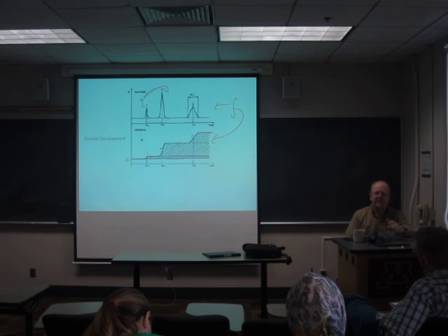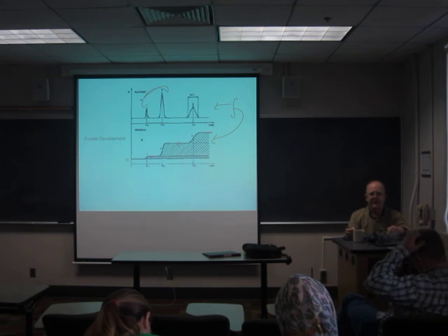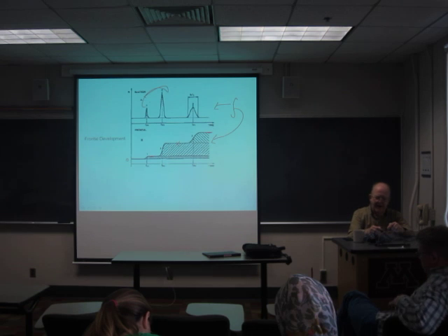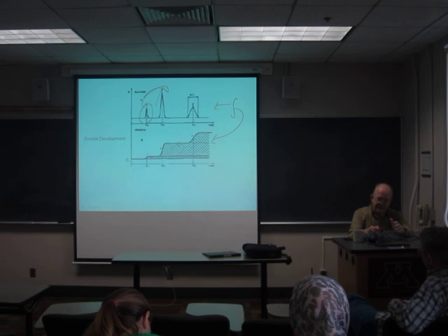But you can see that there's a huge difference between frontal development and zonal development. In zonal development, I can capture this peak, and it's pure, or 99.999% pure. It's not 100% pure. Otherwise, what I told you the other day was not true. This is virtually pure, and this is virtually pure.